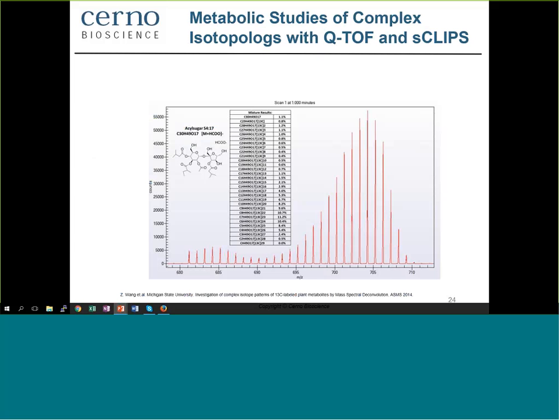But in high resolution mass spec, where the monoisotopic peak is fully resolved, we can actually use the monoisotopic peak itself as the calibration standard. This means that we don't even require a separate standard calibration in order to properly calibrate the mass spec. So that's a really nice advantage in high resolution mass spectrometry. So here we're using that same calibration approach.